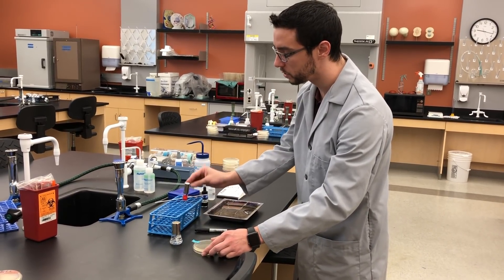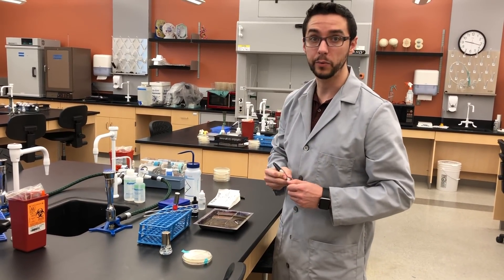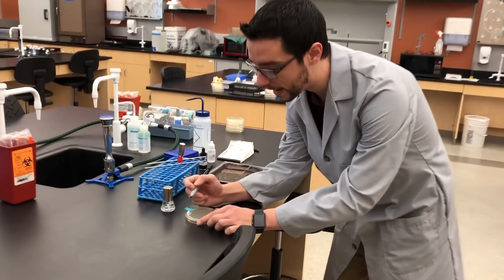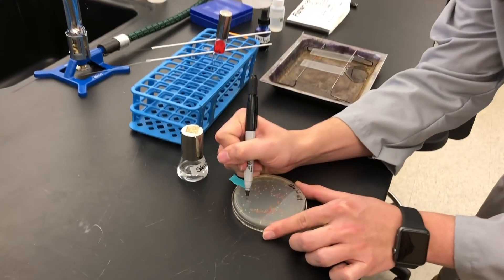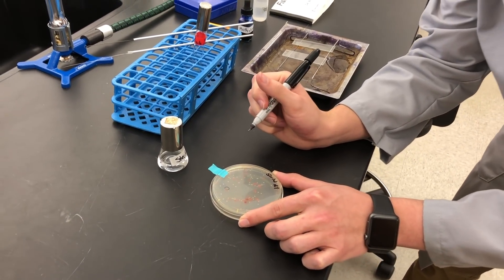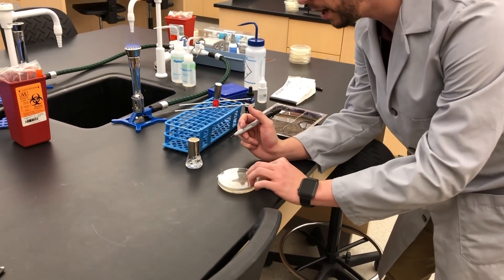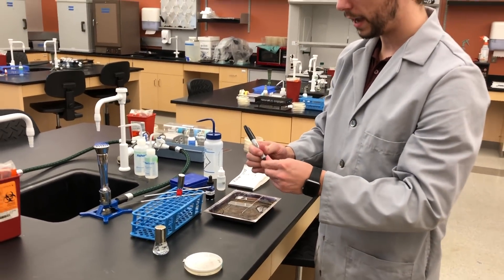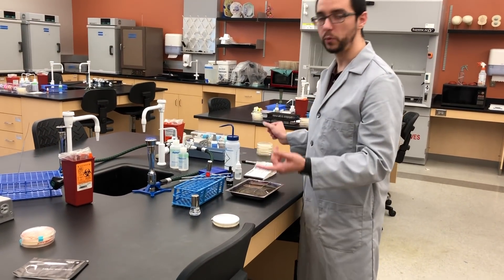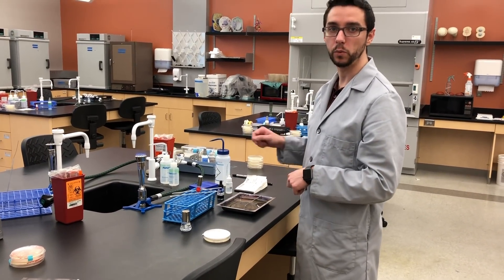Before you do that, while this is cooling, we're going to identify the colony that we want to select. Simply come in with a marker on the backside of the plate. We're going to collect from this red colony there, so that when we flip it we can see it. The benefit is that after we finish all our work with the staining, we can come back and know exactly which colony we just stained.